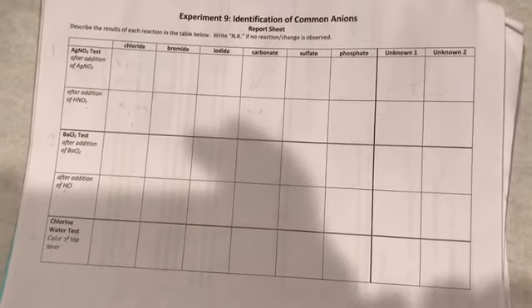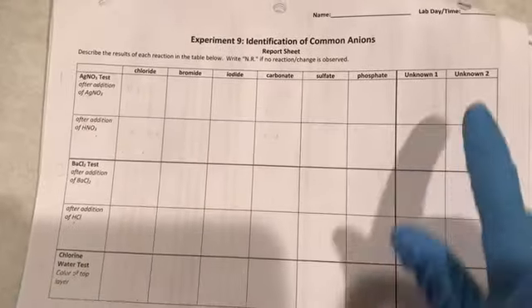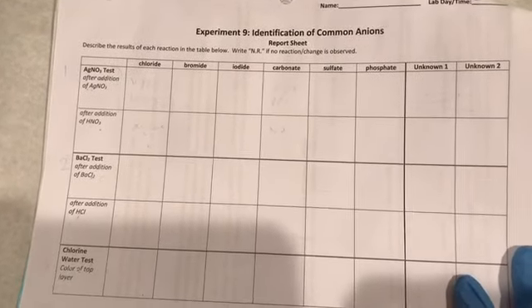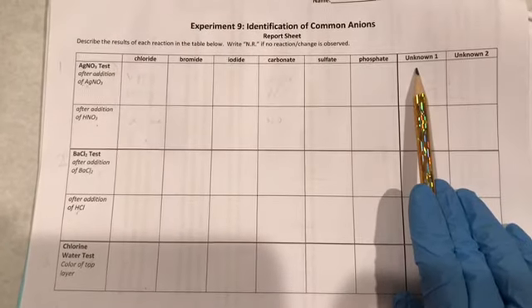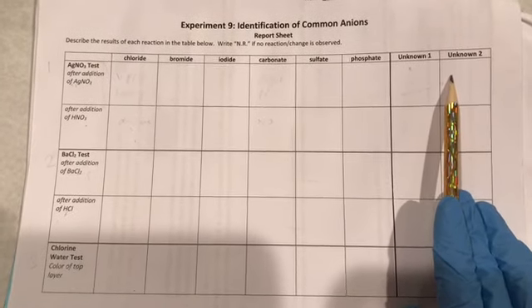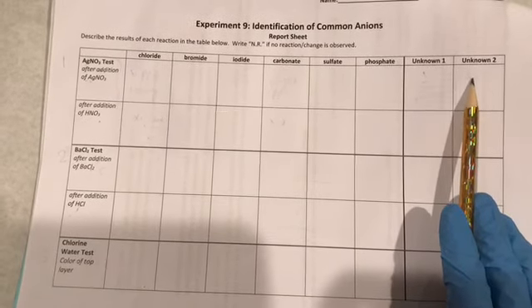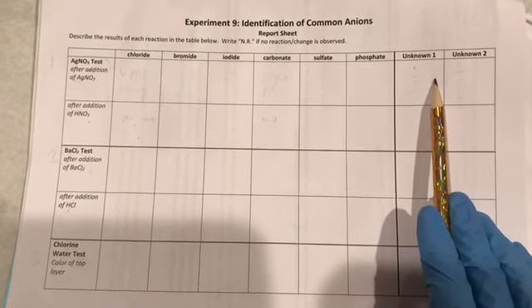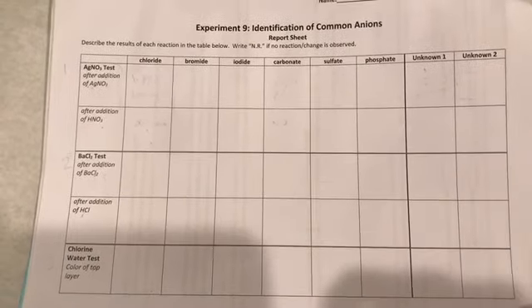Okay, now you are going to record the complete observations on this report sheet, and then figure out what is your unknown number A, unknown number 1, and unknown number B, unknown number 2. Keeping in mind, you would have one unknown from the chloride, bromide, or iodide, and the second unknown might be from your sulfate, carbonate, and phosphate, or vice versa. So basically, one should be your oxyanion and one should be your halide anion. They won't both be halide anions, they won't both be oxyanions. So clearly make your observations chart. This is very important to figure out your unknowns.